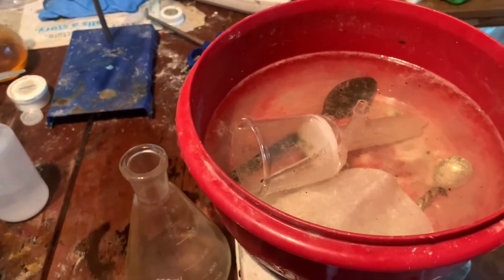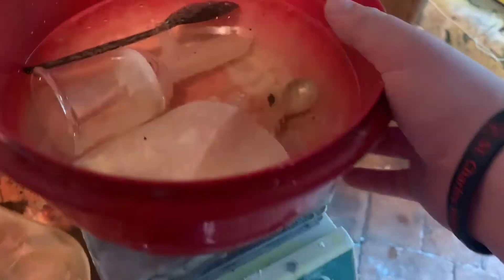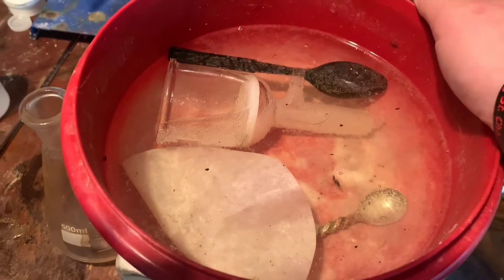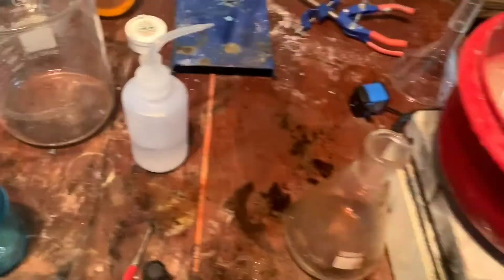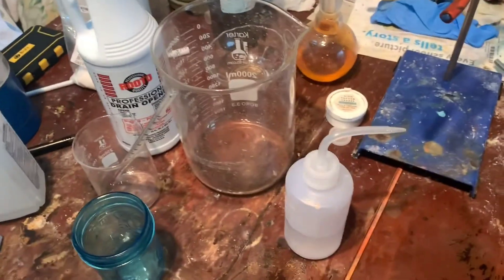You want to neutralize everything that has iodine on it with a basic solution. I'm using sodium bicarb to neutralize it — sodium thiosulfate is a much better choice, but this works in a pinch. Sorry I didn't record the filtration as well — forgot. Stuff happened. Sorry.